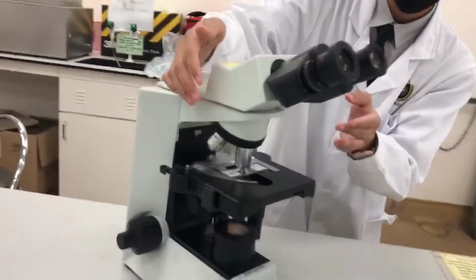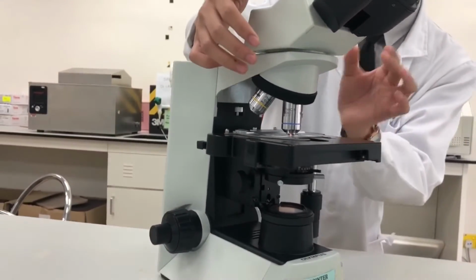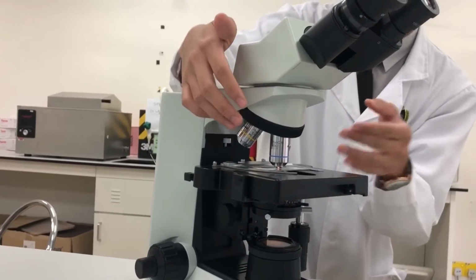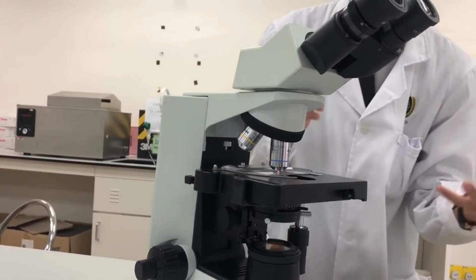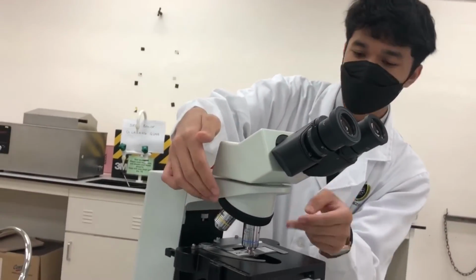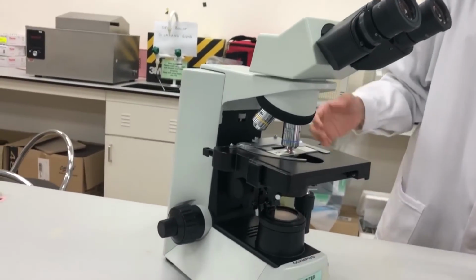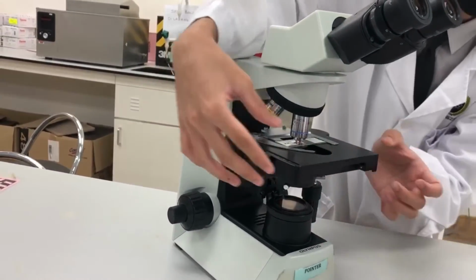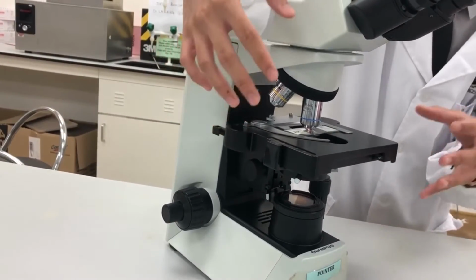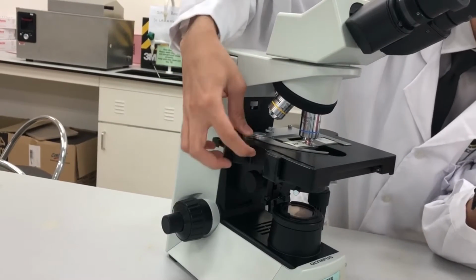And the next is the objective lenses. These are the major lenses used for specimen visualization. They have a magnification power of 40-fold to 100-fold. There are about 1 to 4 objective lenses placed on one microscope. So moving on to the stage. Right here is the section on which the specimen is placed for viewing. They have a stage clip that holds the specimen slide in place.